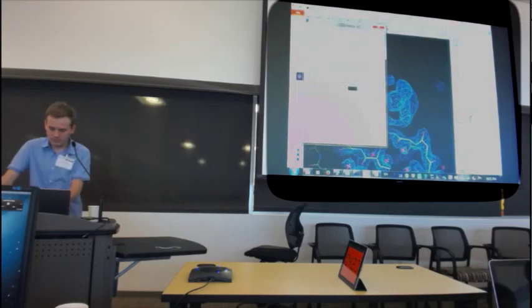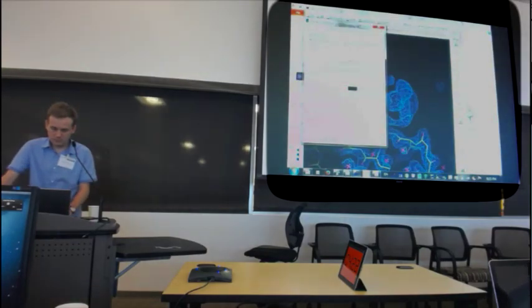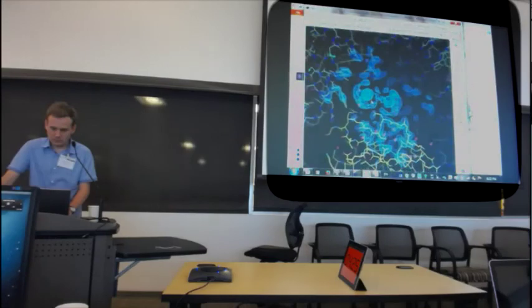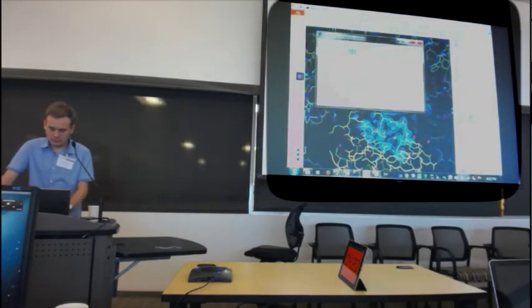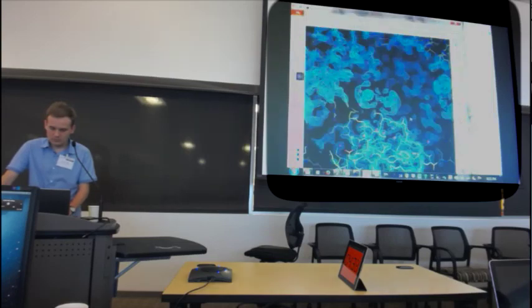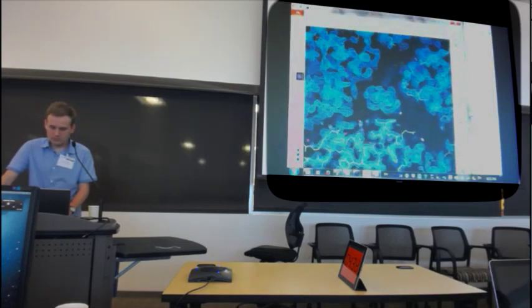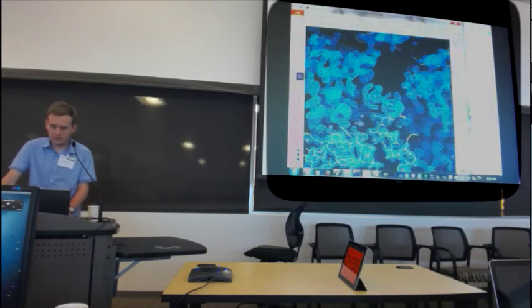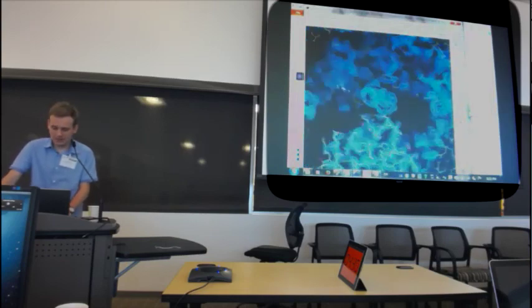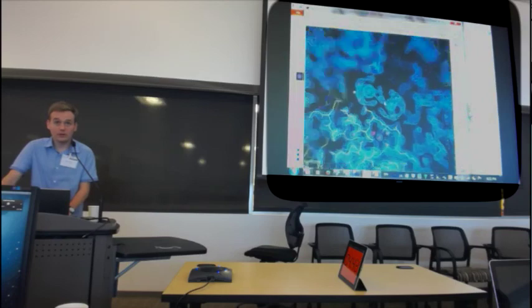Sorry, the keyboard is very much long. So okay, I will try then. The cluster compound, yes, it's the gadolinium HDP something. It should have, and it has those two sites.